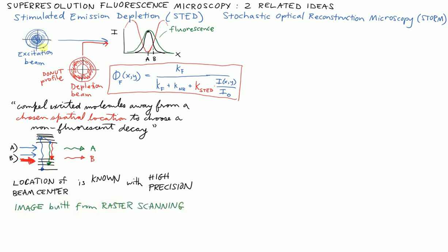And the last thing I'll say about super resolution from STED is that what is the biggest pitfall of cranking up the intensity?